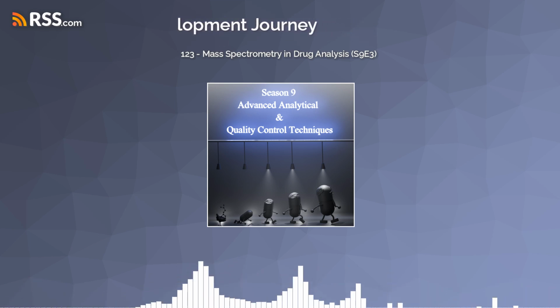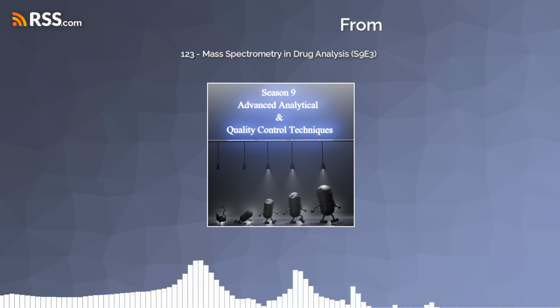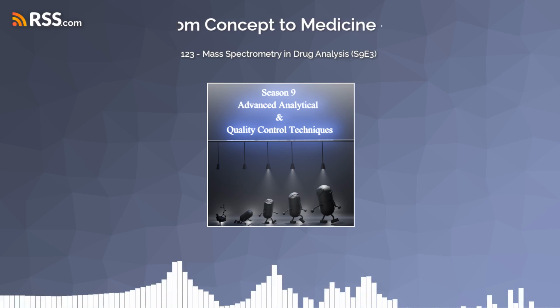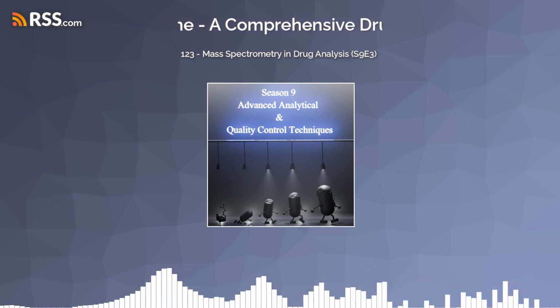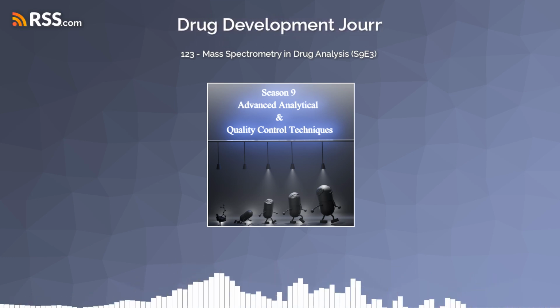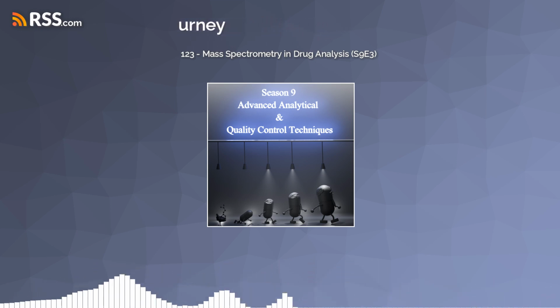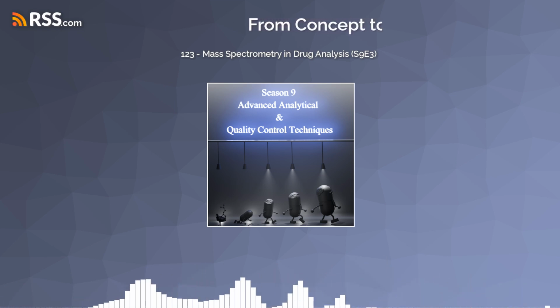Exactly. We need to demonstrate that the method is specific, accurate, and precise. We need to show it can find the smallest amount of a substance we're interested in and measure it accurately. All of this ensures that the results we get from mass spectrometry are trustworthy and can be used for making important decisions about drug quality and patient safety. So a lot of hoops to jump through, but for good reason. Exactly. It's all about making sure those medications are safe.